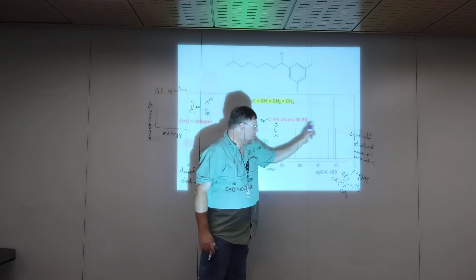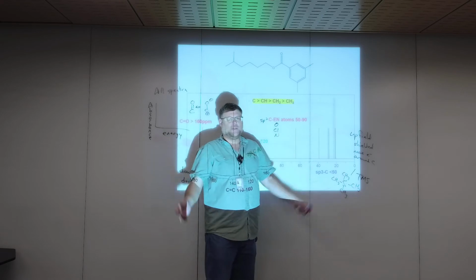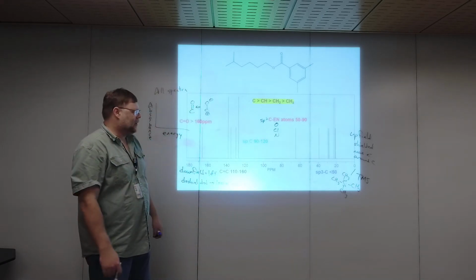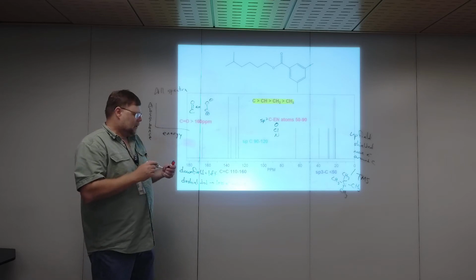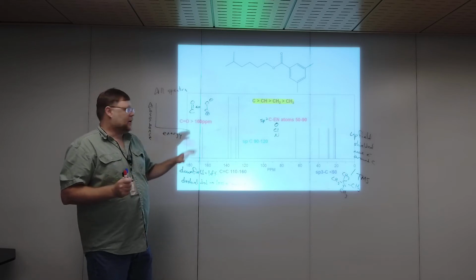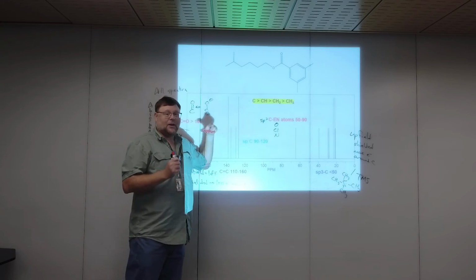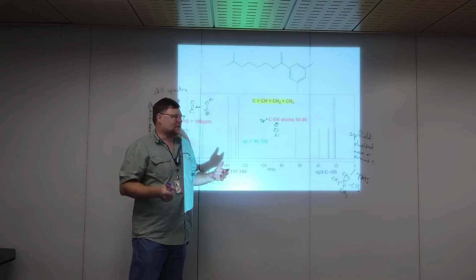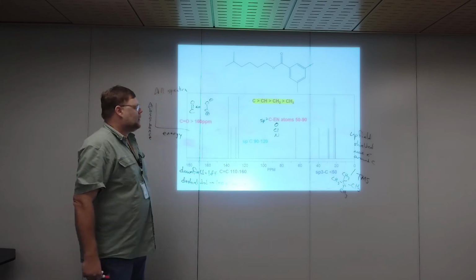And then all the way on the right are just going to be sp3 carbons, right? sp3 carbons bonded to other sp3 carbons, maybe an sp2 carbon. Nothing especially electronegative near it. So it's got more electron density around it. So again, right now, everything in this class is open note, open book. You can use this PowerPoint. So you don't have to memorize this. My goal would be that you would memorize this by working the problems. That's how I memorized it. That's the best way to memorize something, is to work with it.